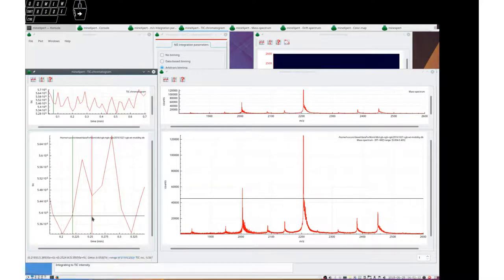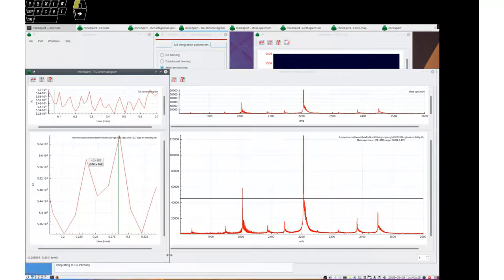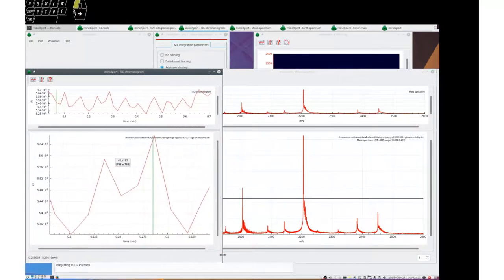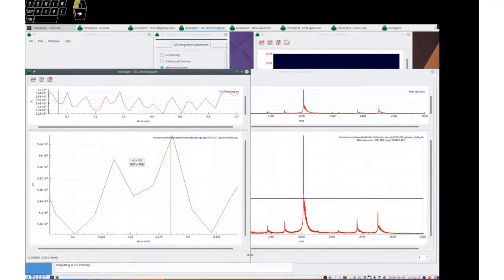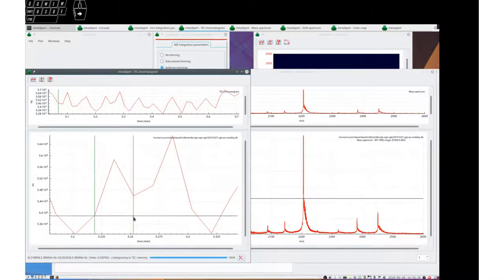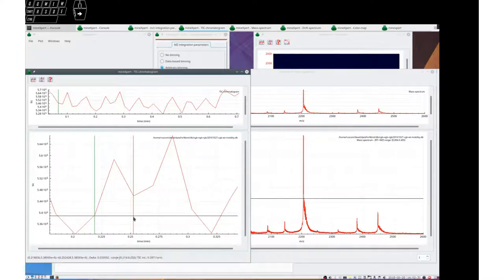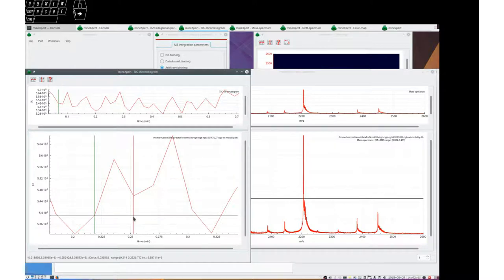And we have in the status bar the intensity, which is not fully displayed because the window is not large enough. Let's increase the window size and do that again. You will see the intensity value. There we are, 5.6 exponent 6. This is the intensity as it has been computed by going back to the original data.